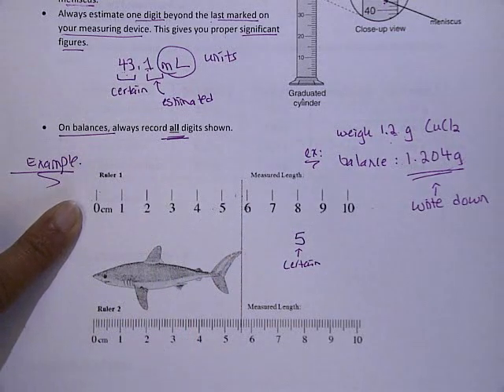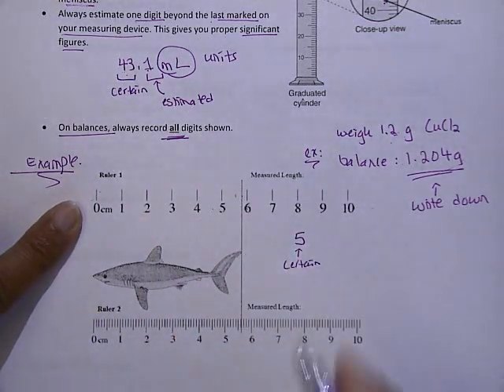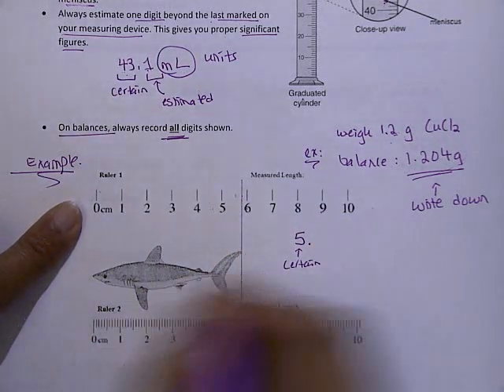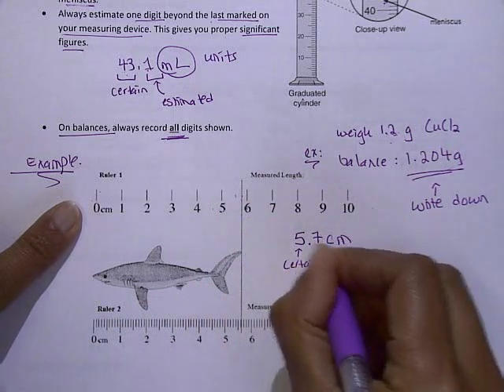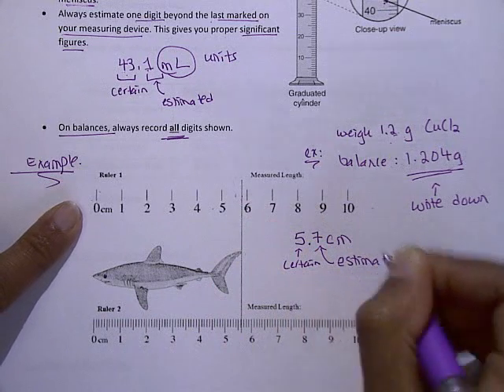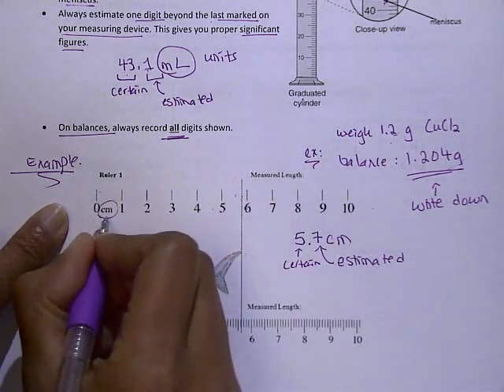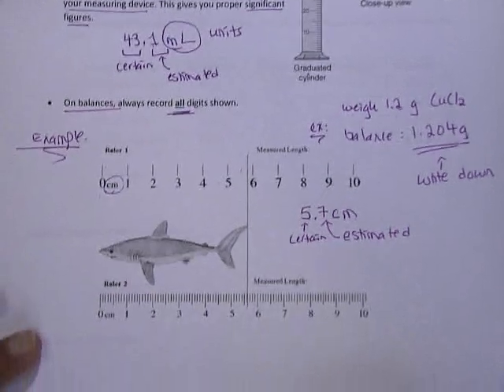Now this looks like it's slightly beyond 5.5. So someone could see this as 5.6. Someone else could see it as 5.7, 5.8. The estimated digit is where the uncertainty lies. So I'm going to say this to me looks like 5.7. So 5.7 is my estimated digit, and my units are centimeters because it tells me here what my units are. Every measuring device will have the units on them.